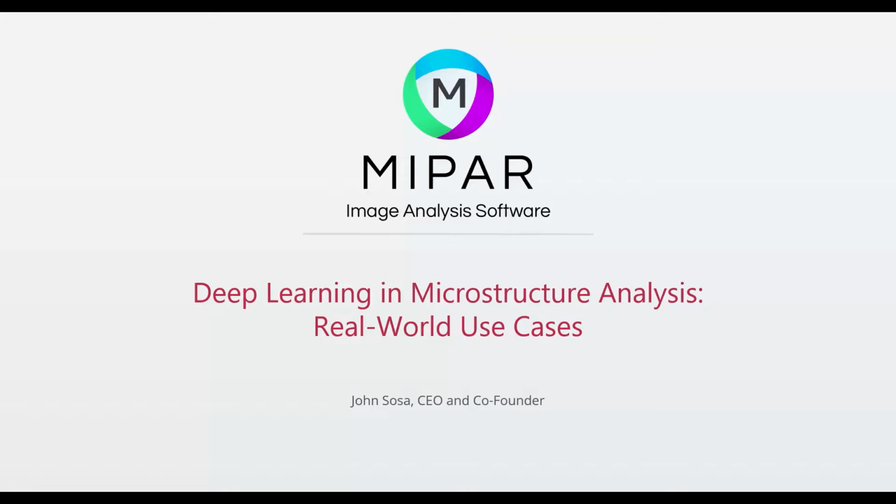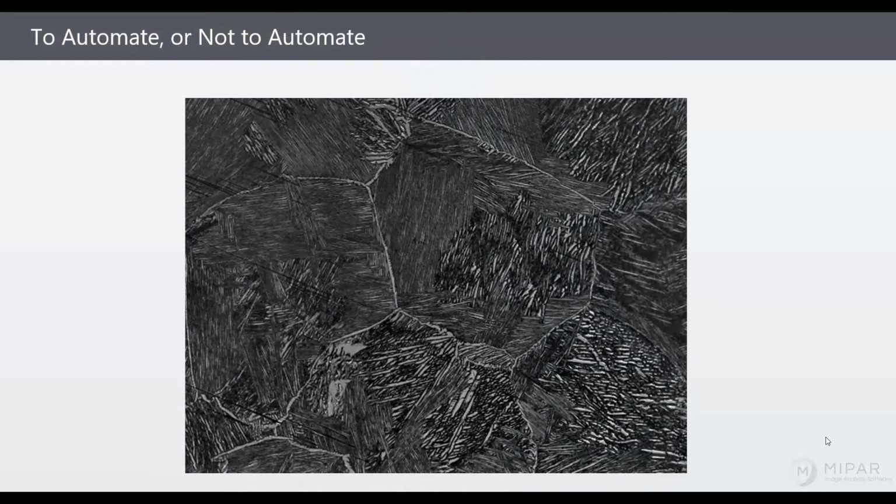So where I'd like to get started is by considering an example such as this one. This is a titanium microstructure. Specifically, we're looking at prior beta grain boundaries. So the area in here at one point at high temperature was all beta phase. As the sample was cooled down, the alpha phase precipitated inward, and you're left with these boundaries where a certain type of alpha has precipitated along them, thereby revealing them. But since the material is no longer entirely beta, we refer to this as a prior beta grain structure.